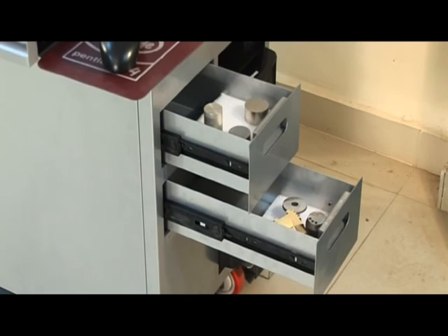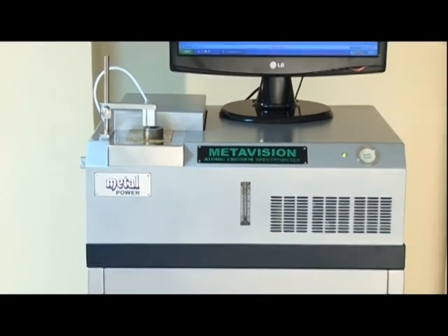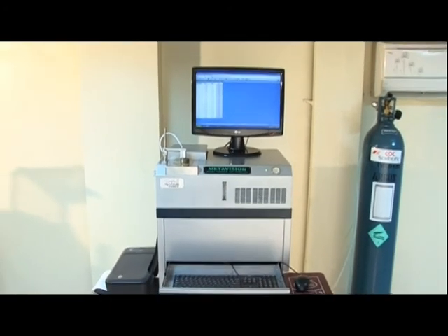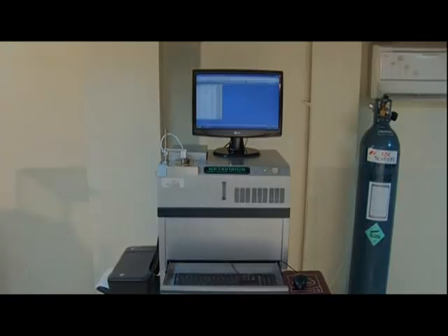Metal Power's MetaVision is a trusted product for metal analysis with accuracy and precision. Metal Power, your partner in success.